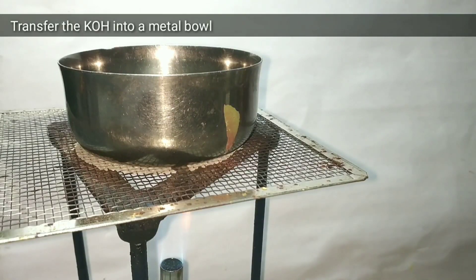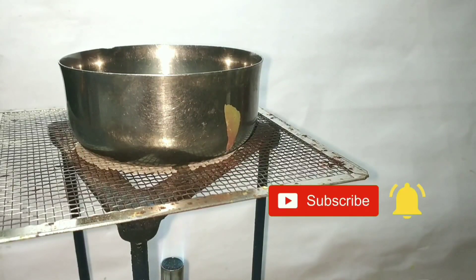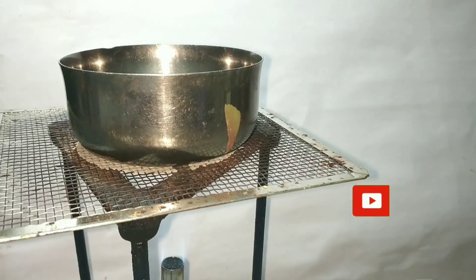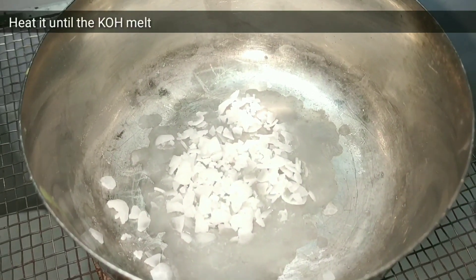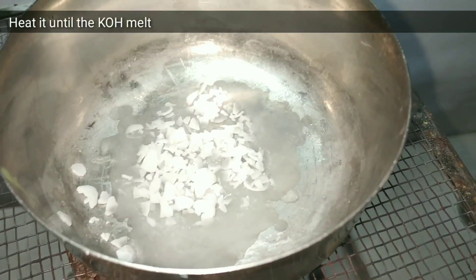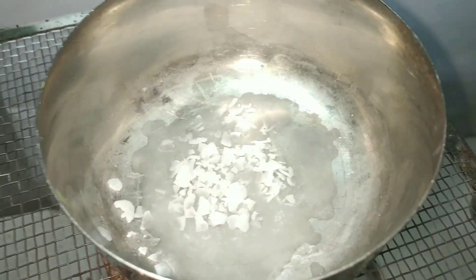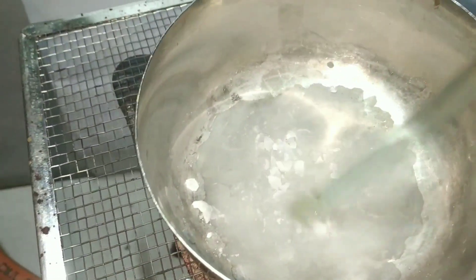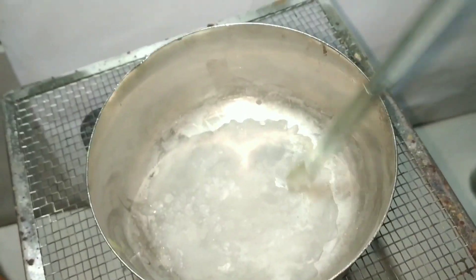Start by heating a metal bowl and transferring 6.5 grams of potassium hydroxide into it. Continue heating the bowl until the potassium hydroxide melts. Mix the contents well so that all the chunks and flakes of potassium hydroxide melt and it forms a uniform liquid.